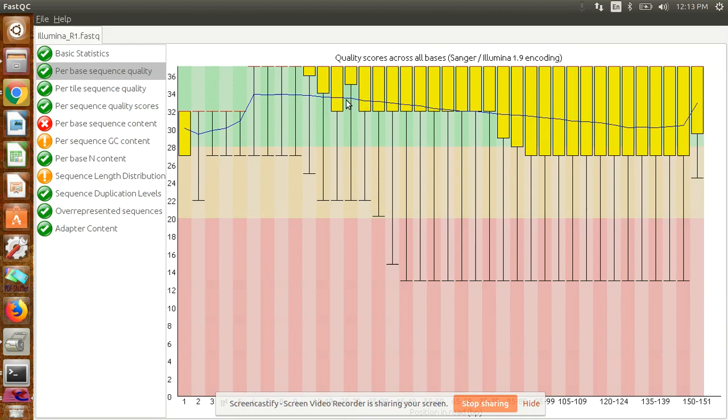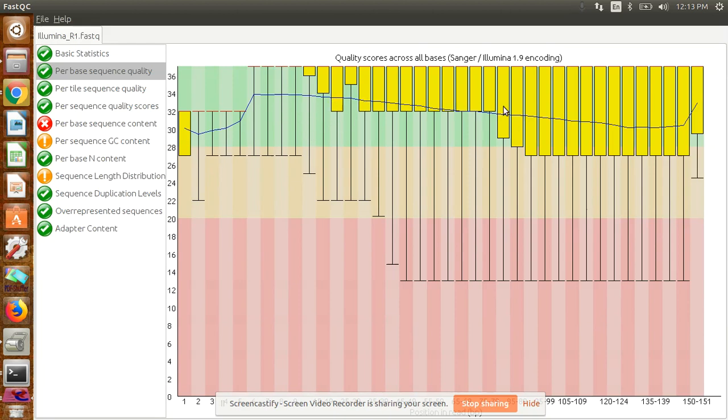No sequence should fall in the red region where Phred score is less than 20. If Phred score is 20, the probability of error is 1 in 100, and for 30 it's 1 in 1000. Your sequence quality should fall into the green region. Then your sequence is good quality. This is the main parameter you have to check.